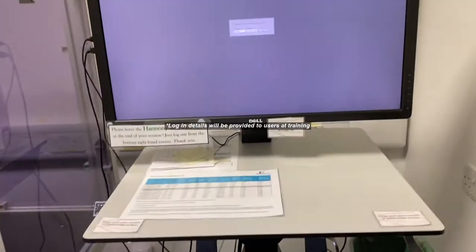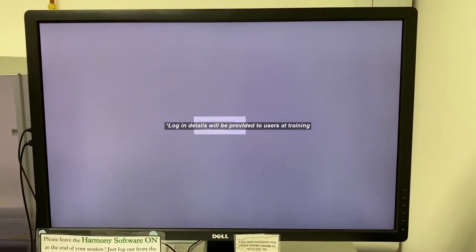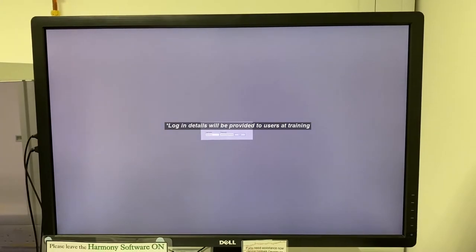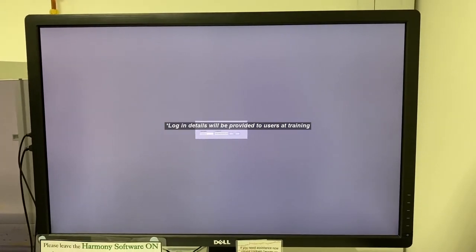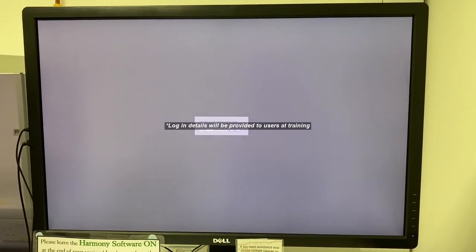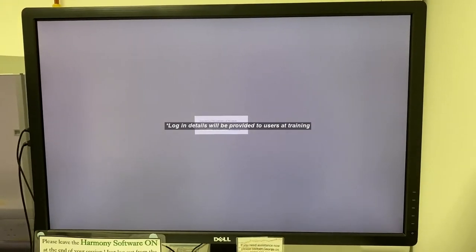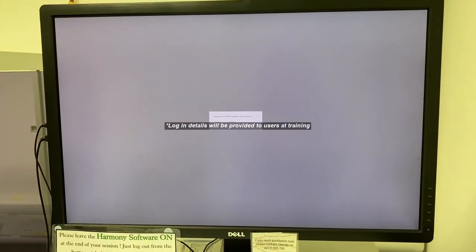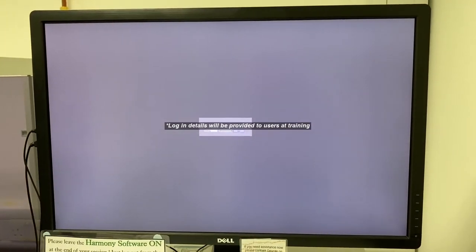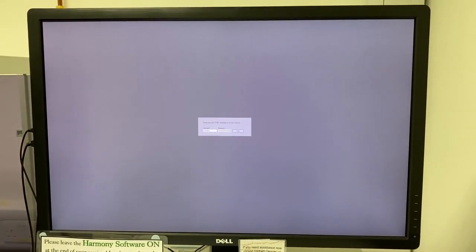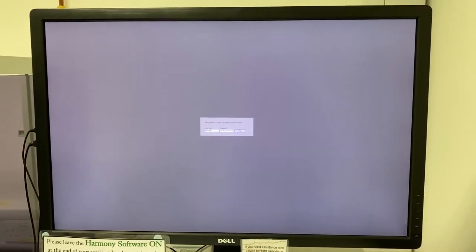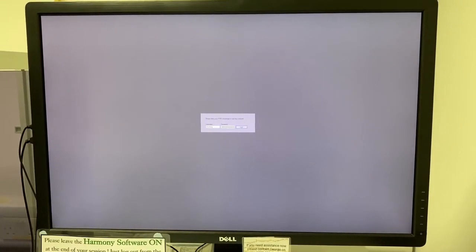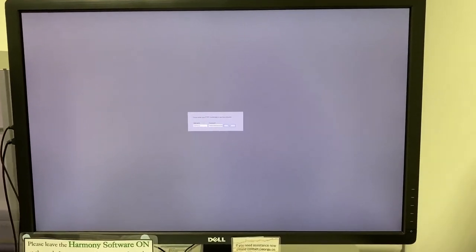Once you've done that, you want to log into Windows. The Windows login is Opera, so capital O and small P-E-R-A. Once you're inside Windows, this screen should come up. This is your PPMS booking system login, so you want to put your username and password and login so we can start tracking your usage.